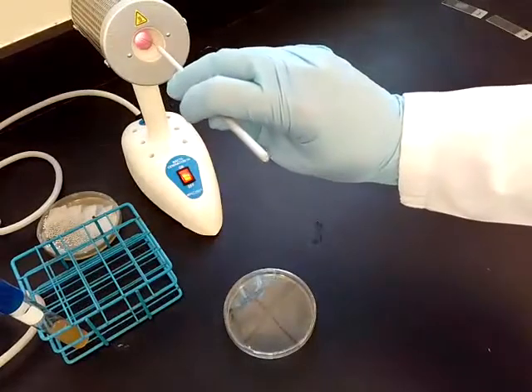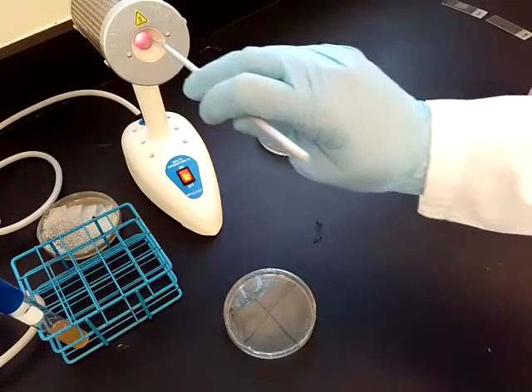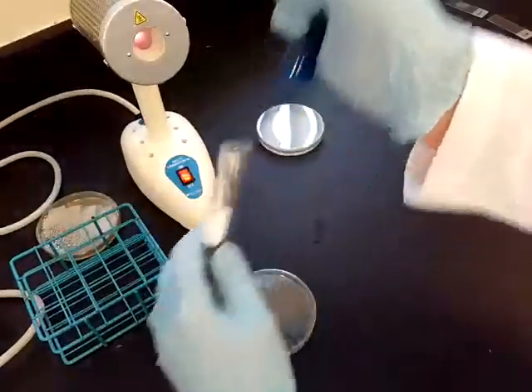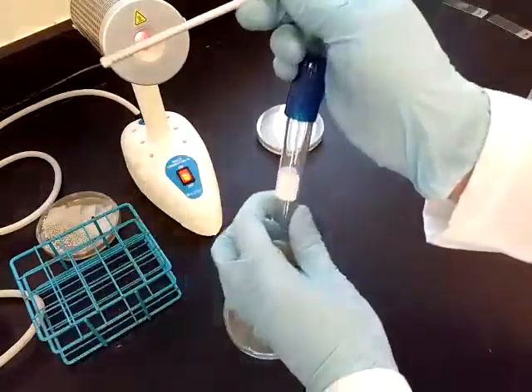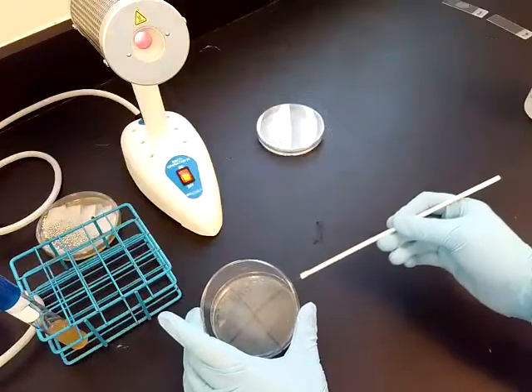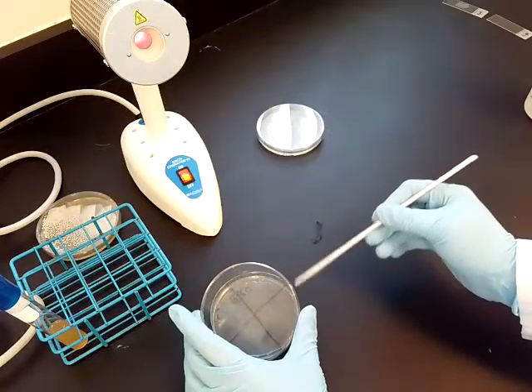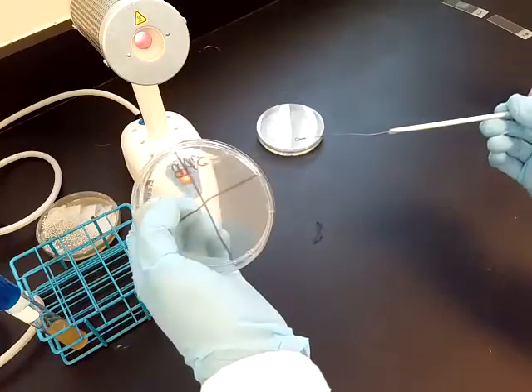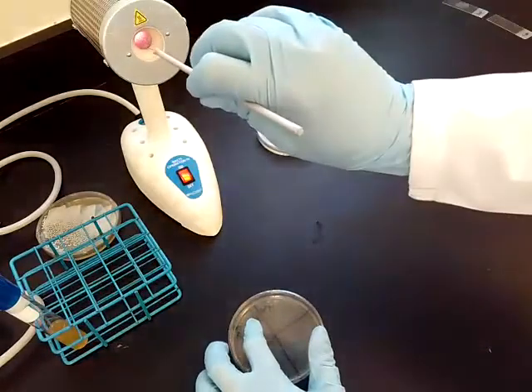To do this, you're going to flame sterilize your loop, obtain the bacteria, aseptically take off the cap, swirl it around in the tube, put the cap back on, and then you're going to smear the bacteria in the first quadrant. Because I drew the quadrants on the bottom of the plate, I can see through the plate where the quadrants are. So now I know I just streaked into that quadrant.